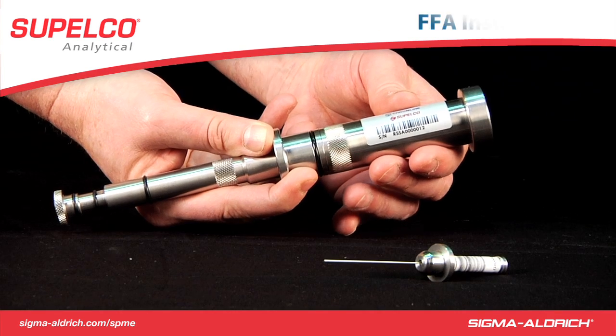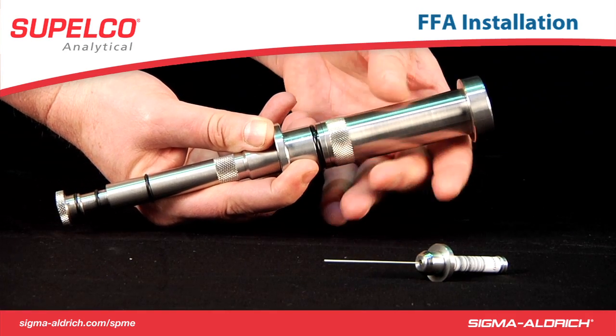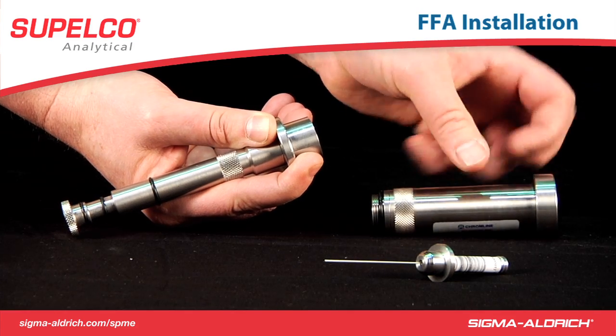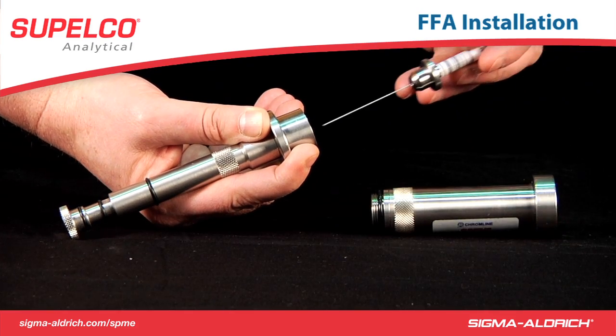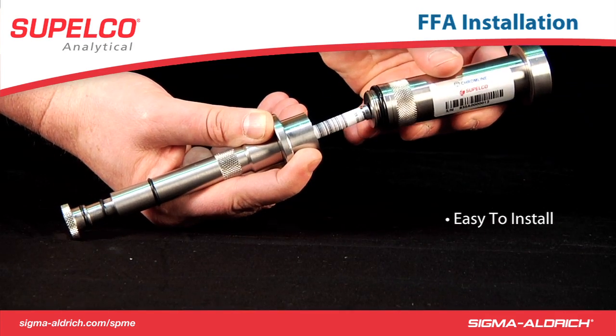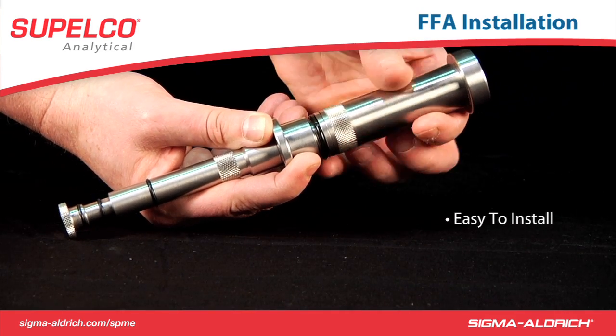The FFA can then be installed into the holder by unscrewing the sampler body screw. The FFA needle is gently pushed through the septa, and the holder is reassembled. No other manipulation is needed, making fiber installation as easy as changing an ink cartridge in a pen.